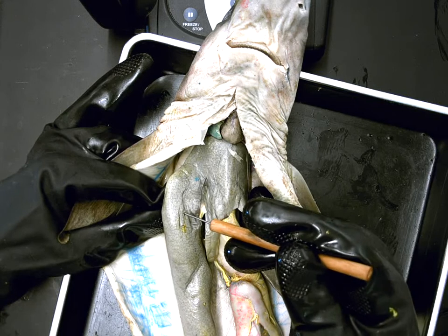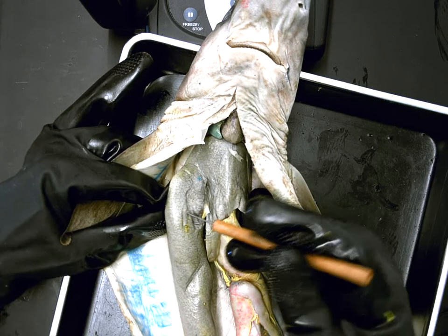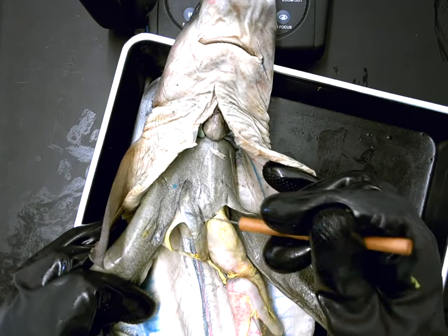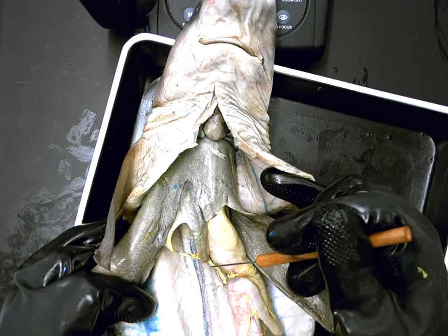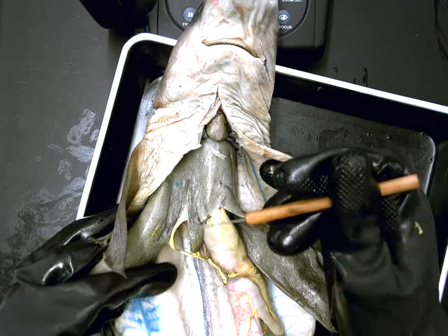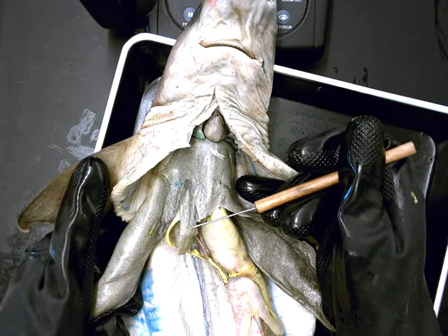Removes metabolic waste. Shervin, last function? Oil for buoyancy. Excellent. If we go to the middle lobe of the liver, there's going to be this kind of deflated balloon, which is extending off the middle lobe. The name of this is? Gallbladder. Its function is?